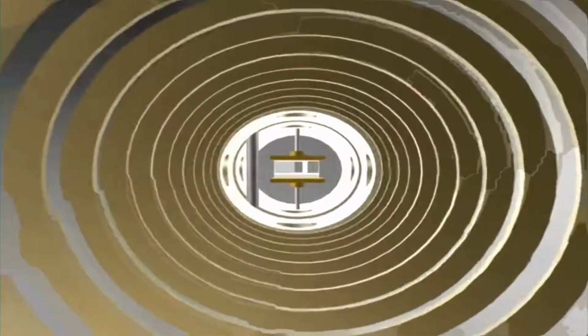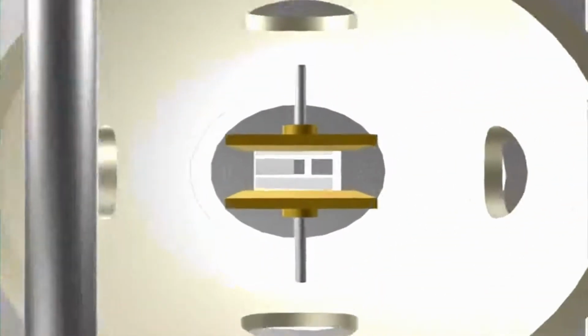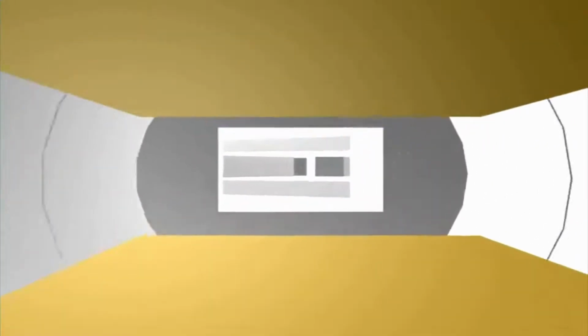The uniform electric field needed for acceleration is produced only inside the acceleration tube and not at the entrance or exits of the tubes. The effect of a non-uniform field is to cause unwanted beam focusing, particularly for particles with low energies, effectively filtering them out.